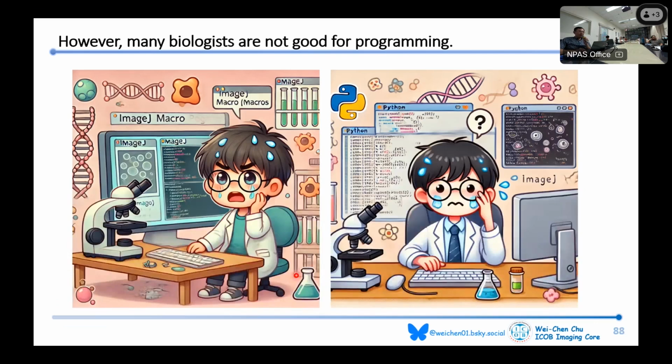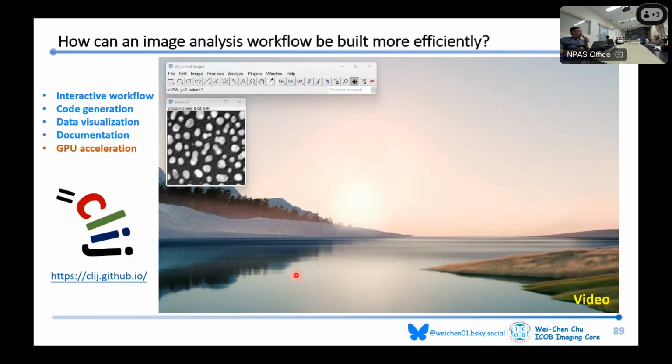Okay, I'm a biologist, so I know coding is a bit difficult for people like me.